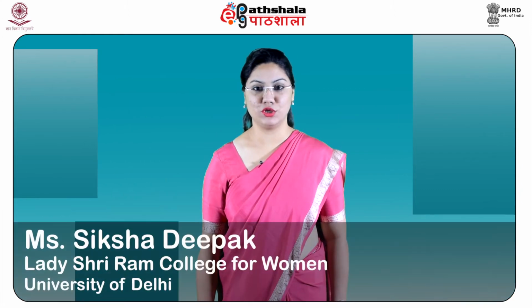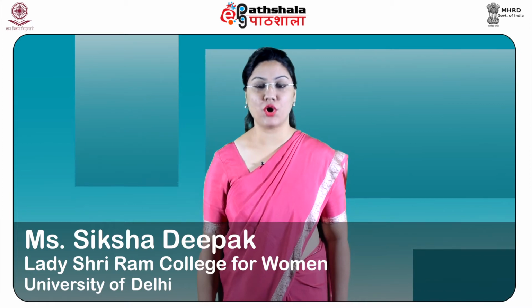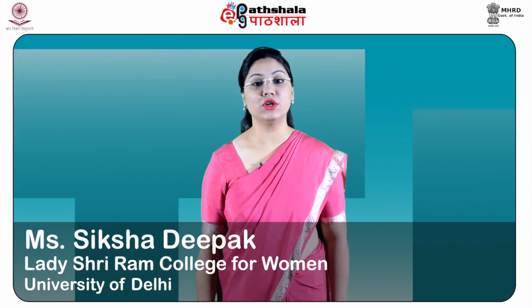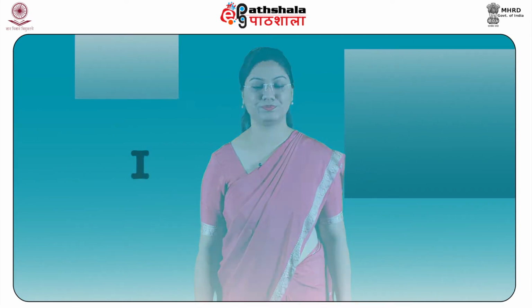After studying this module, you shall be able to learn about preparation of brain tissue for microscopic examination, learn about several stains used to highlight brain structures, learn about various anterograde and retrograde methods of labeling, learn about techniques to study living brain, learn about different types of microscopes used to study brain tissue.